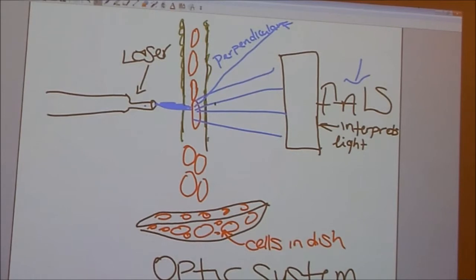So light scatter and fluorescence are captured, they're spectrally filtered, and they're directed into the appropriate photodetector for conversion into electrical signal. So the light scatter is collected in 2 different angles, as I said, the forward angle light scatter and then the perpendicular light scatter. So now I'm going to tell you what they do.